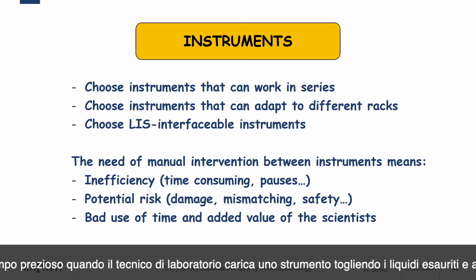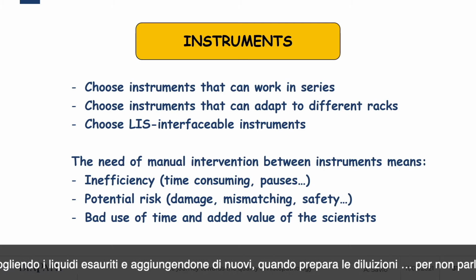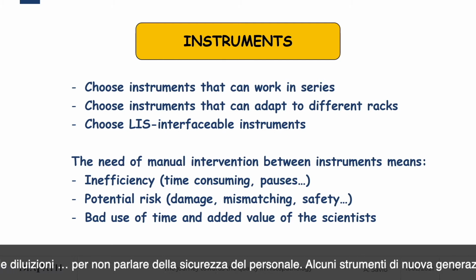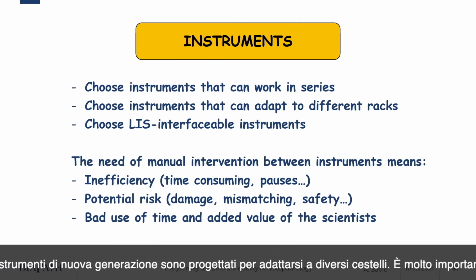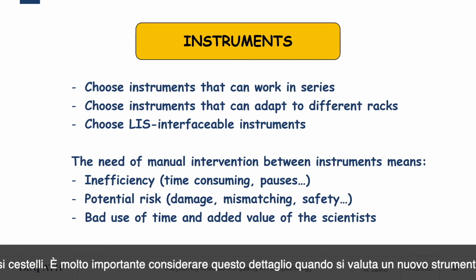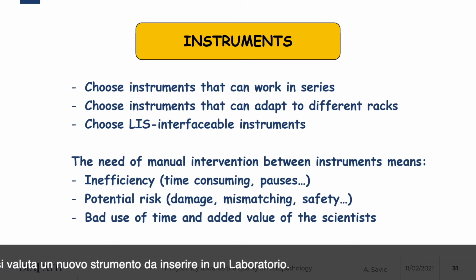Similarly, it is inefficient and a waste of precious time when the lab scientist loads an instrument, removing exhausted liquids and adding new ones, when preparing dilutions, not to talk about staff safety. Some of the new generation instruments are designed to adapt to different racks. It is very important to consider this detail when evaluating a new device to be installed in a laboratory.